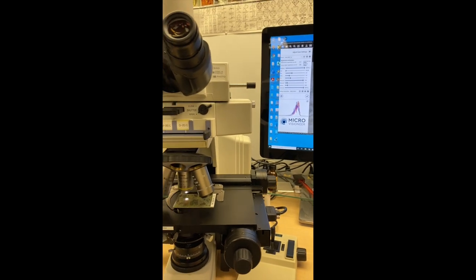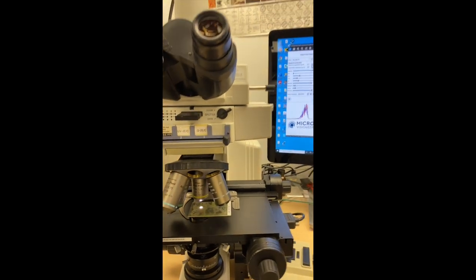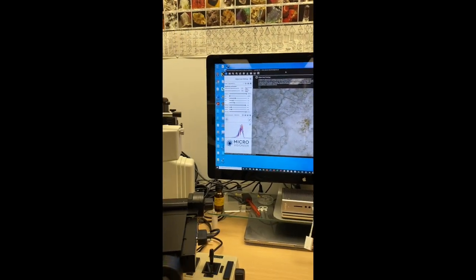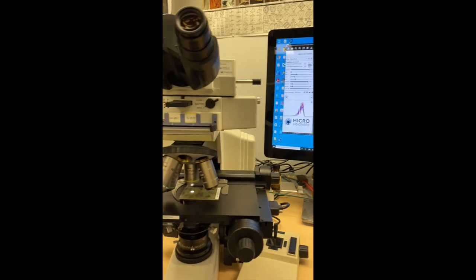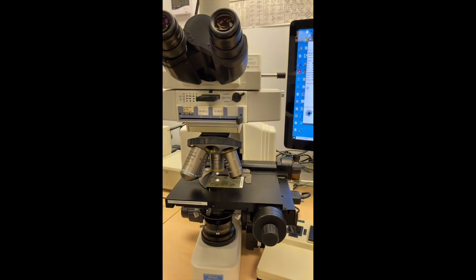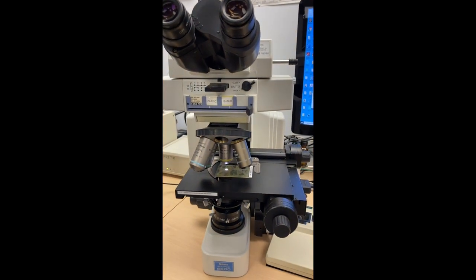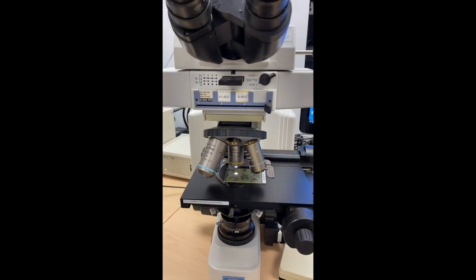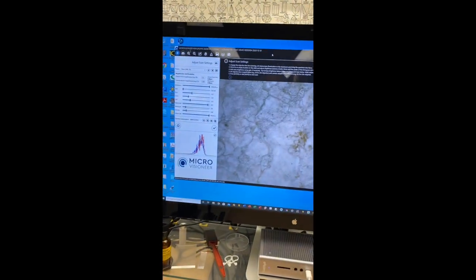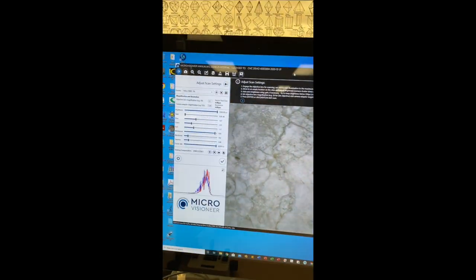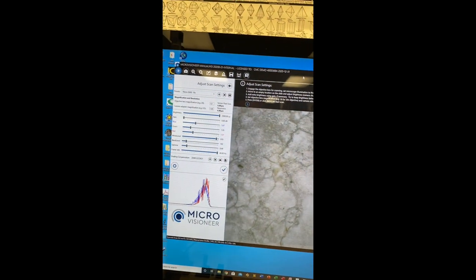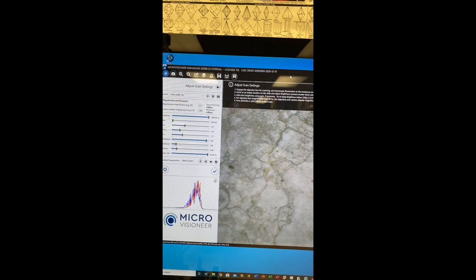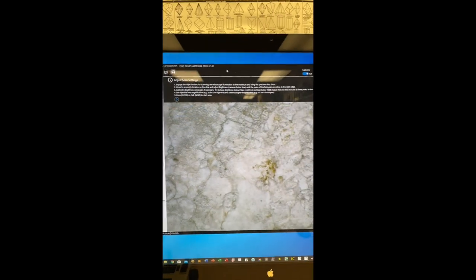Here is a short demonstration of how to automate scanning of a thin section using Microvisioneer's manual WSI software.